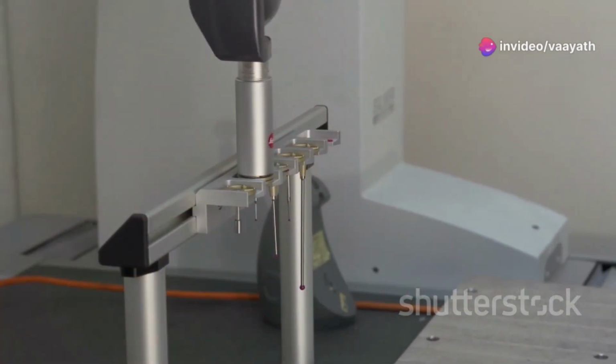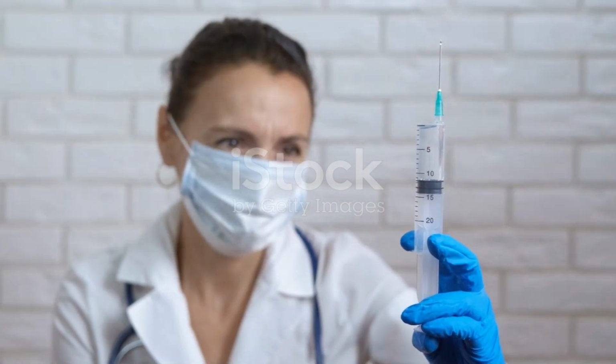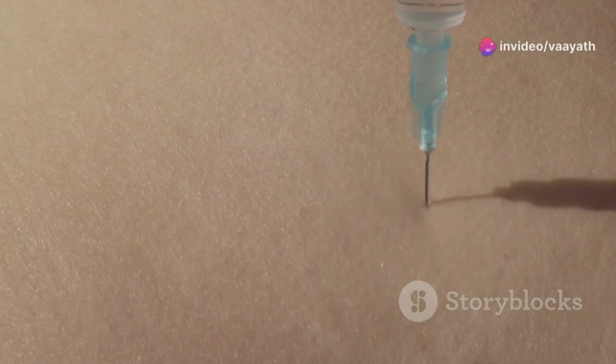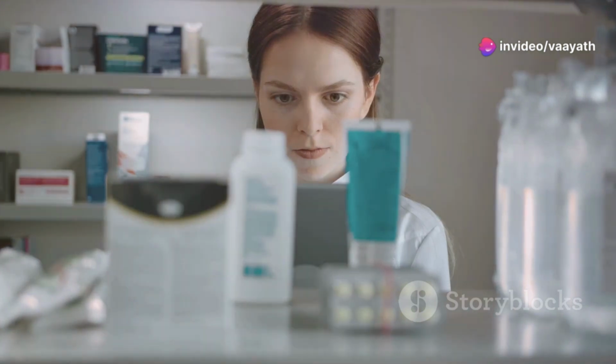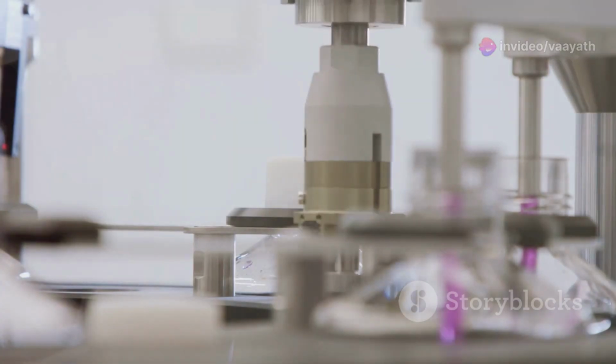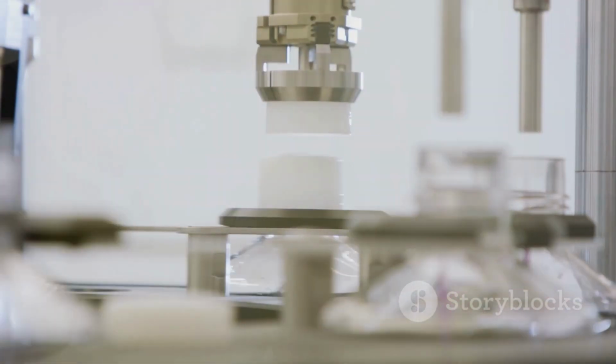Media fill validation is not just a regulatory checkbox, it's a critical safeguard for patient safety. Injections bypass the body's natural defenses, making contamination extremely dangerous. Contaminated medicines can lead to serious infections, even death. The consequences of a single failed batch can be devastating, both for patients and the pharmaceutical company.